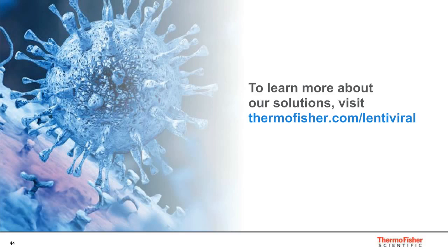We have one more for you. Do you have plans to develop protocols for larger scale than 2-liter bioreactors? Yes, and that's what we're doing right now. After developing each component, we're now developing a large-scale protocol. We have one for bioreactors, and I'll show on the slides that it shows similar results.